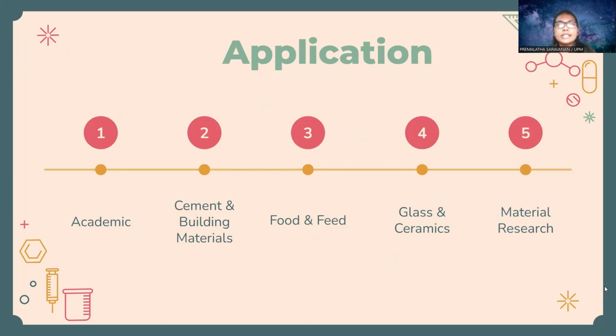Finally, we are here at the application of XRF spectrometer. At first, we would like to talk about academic. So, as for academic, just like a university student, universities and research institutions perform fundamental research on element concentration on a variety of samples using WDXRF with high spectral resolution with up to 4 analyzer crystals.